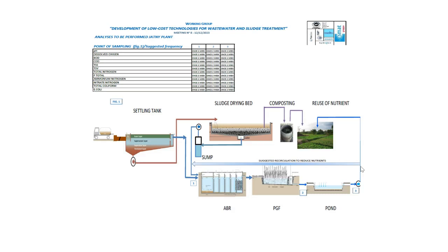At the end of number 3, Mr. Rapata said that it is possible to recirculate the water by a pump in the first step. Which is number 2? It is the 3. Okay. After PG, at number 3, we have the fountain. Is that correct? Yes, at point number 3.